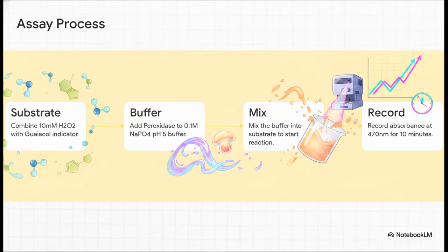First, you combine a 10 millimolar hydrogen peroxide substrate with the guaiacol indicator. Then, you introduce your peroxidase enzyme into a specific sodium phosphate buffer set to a pH of 5. The absolute second they mix, the clock starts. By recording the absorbance at 470 nanometers every single minute for 10 minutes, you generate this beautiful linear slope of data. It's a fast, highly reliable way to quantitatively track enzyme activity right there at the lab bench.